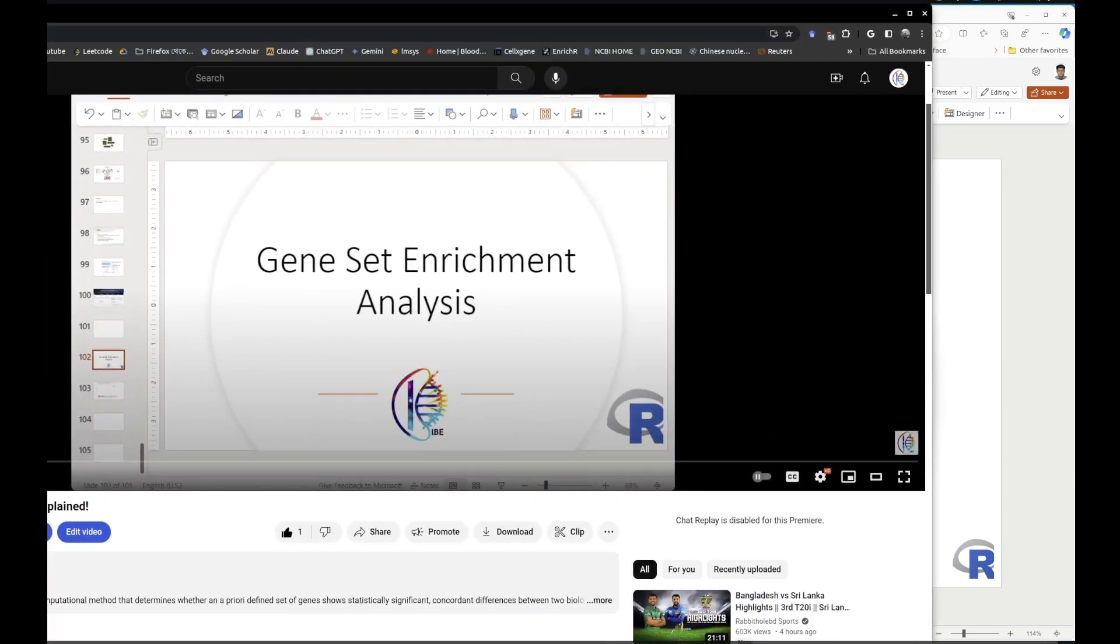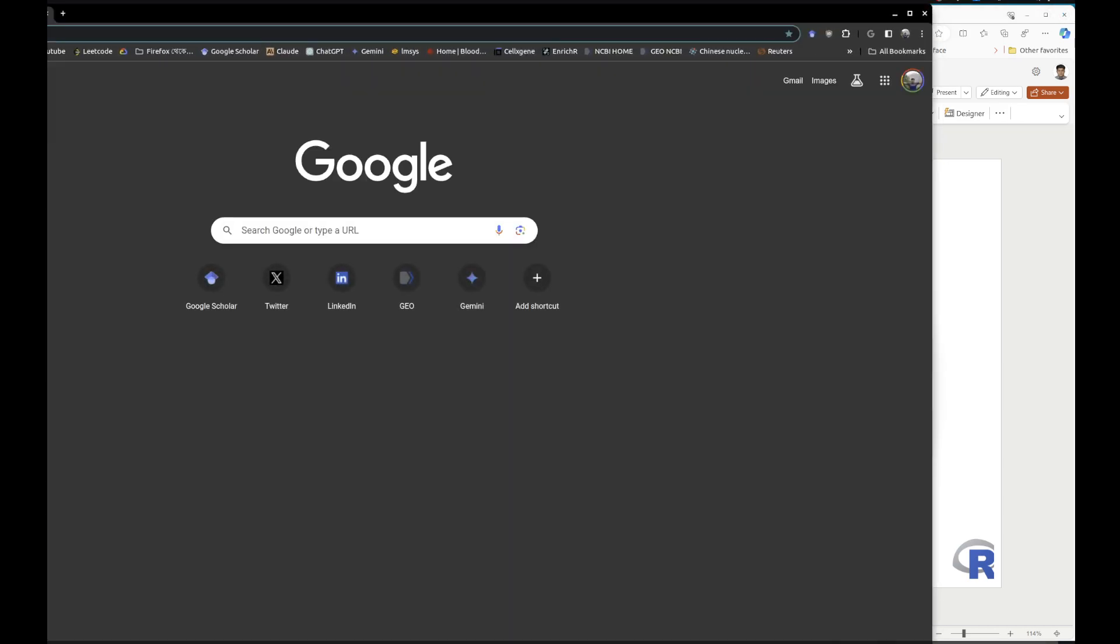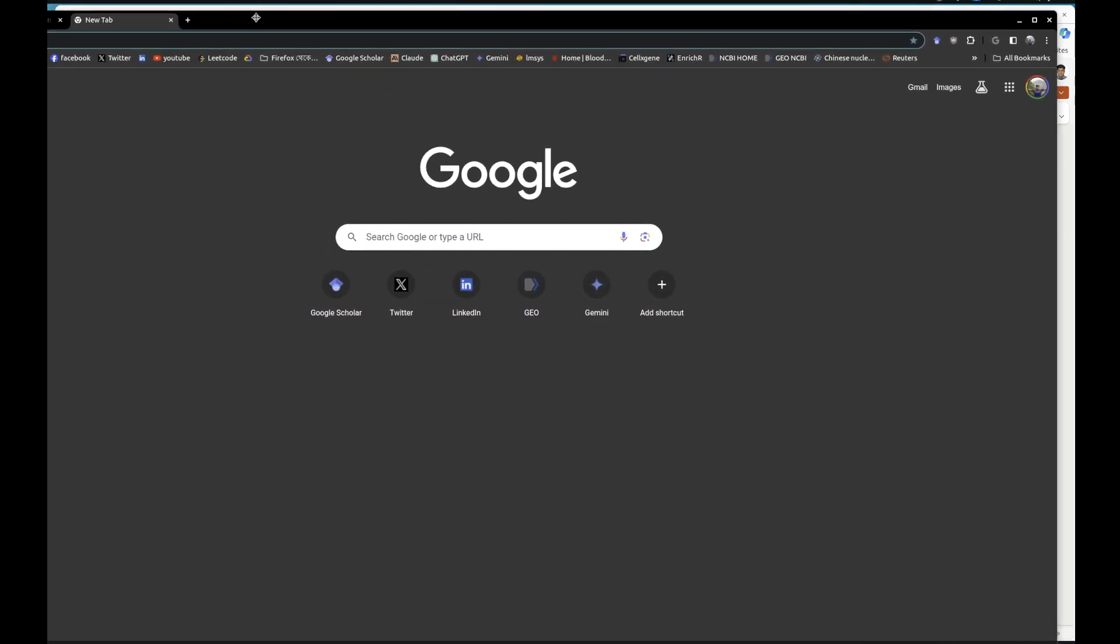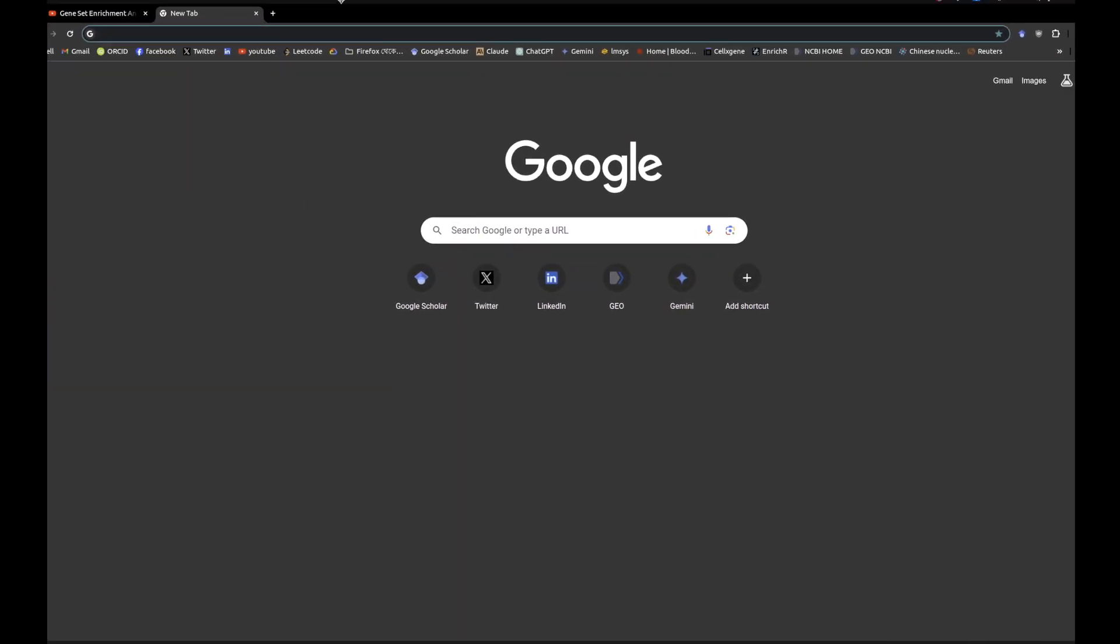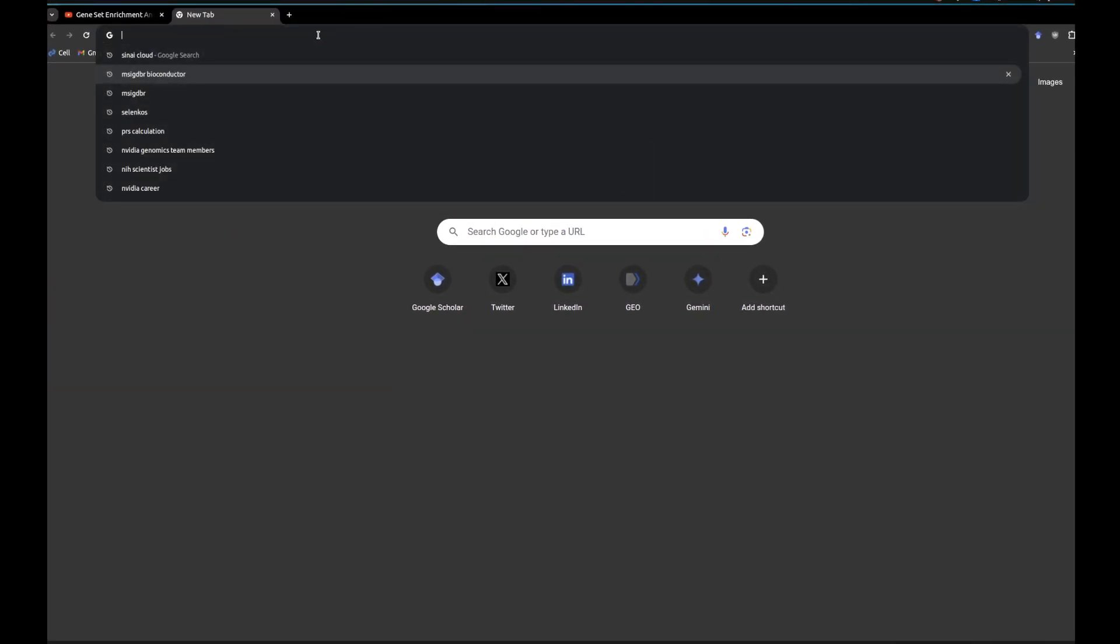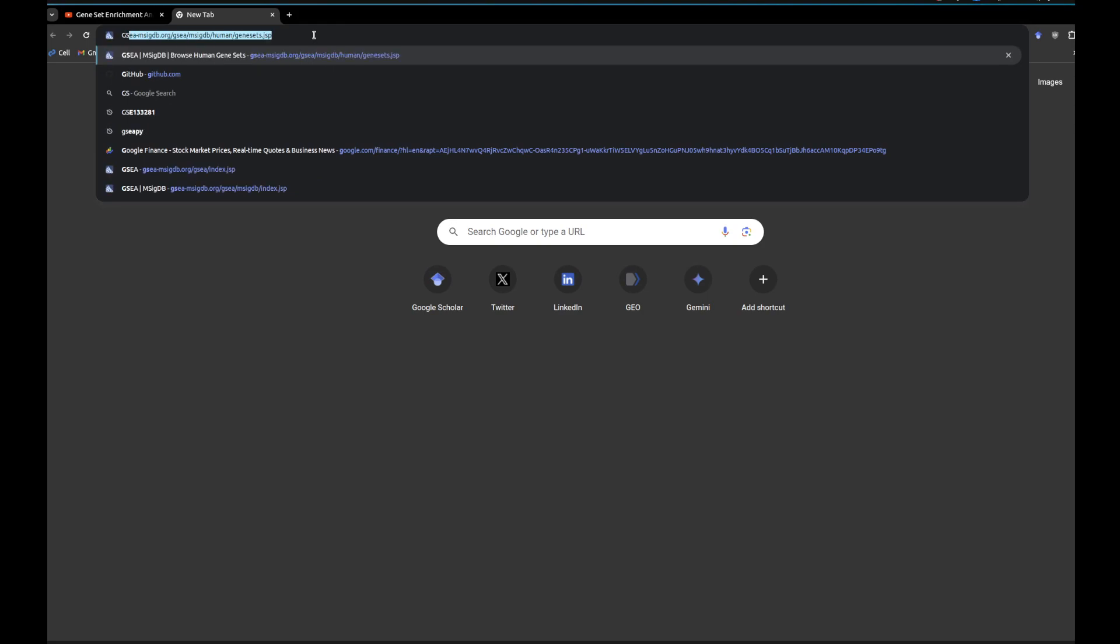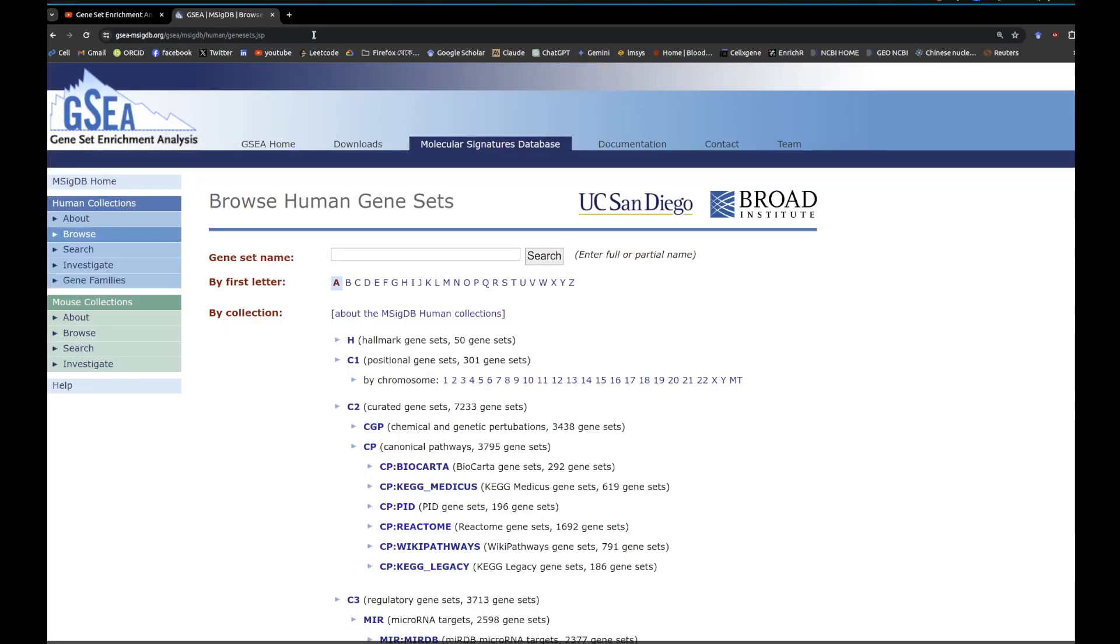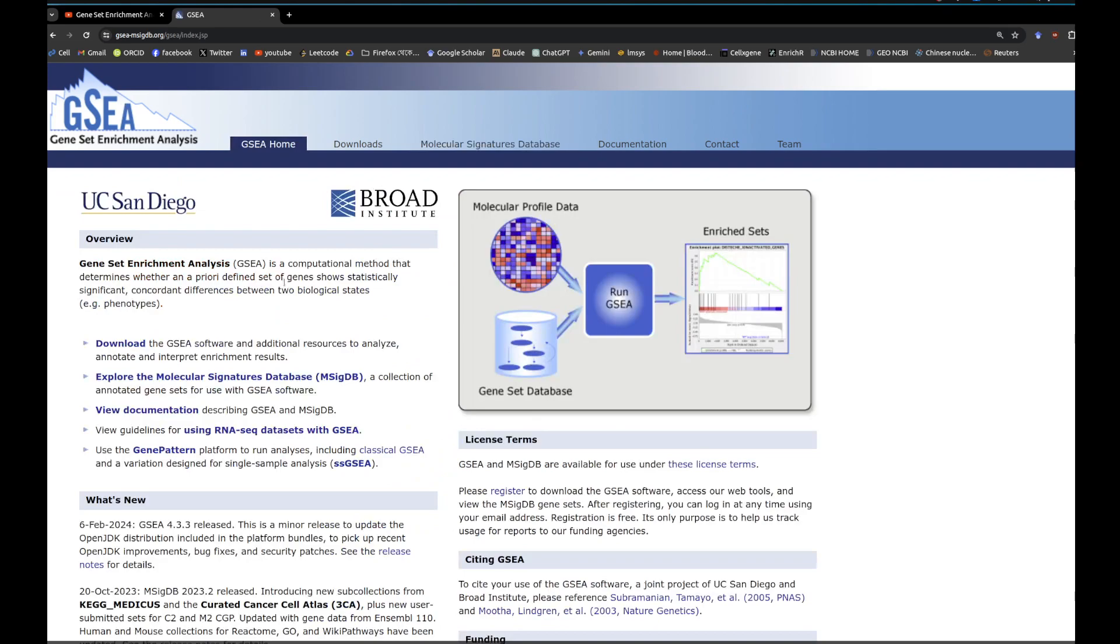Let's search for GSEA. Essentially, for recapping, we're taking our gene list with all relevant data, comparing against the gene set database, running it, and getting these enrichment scores.